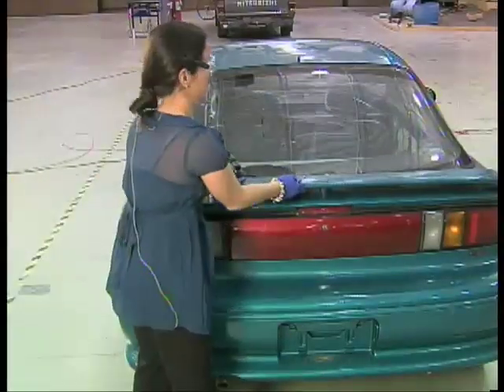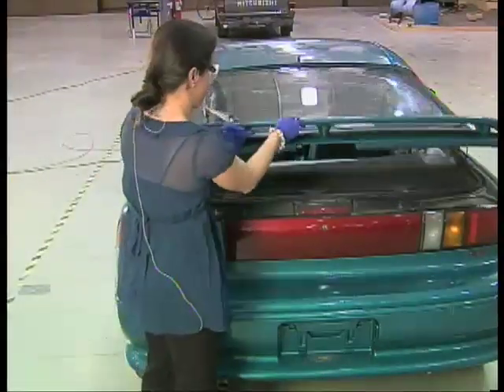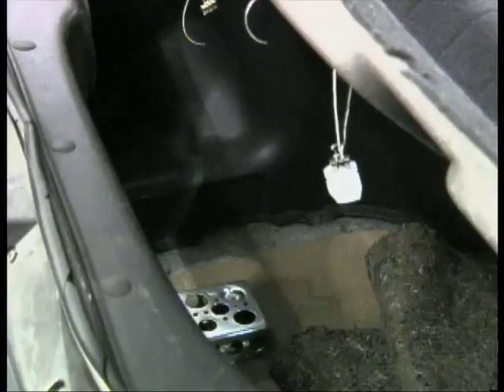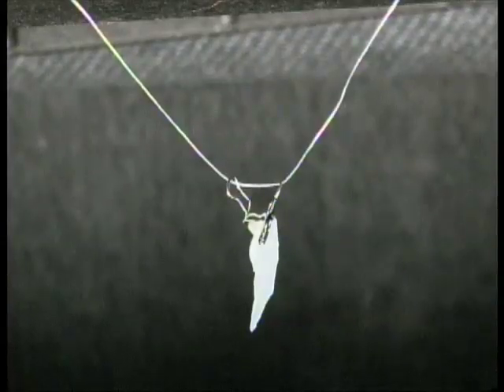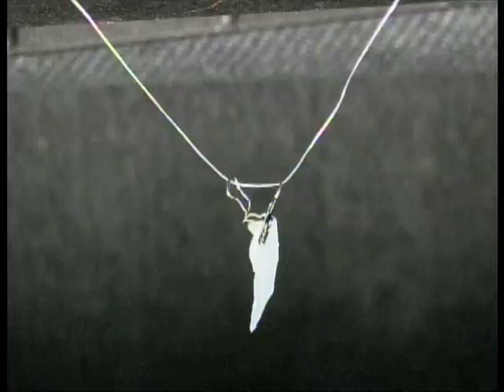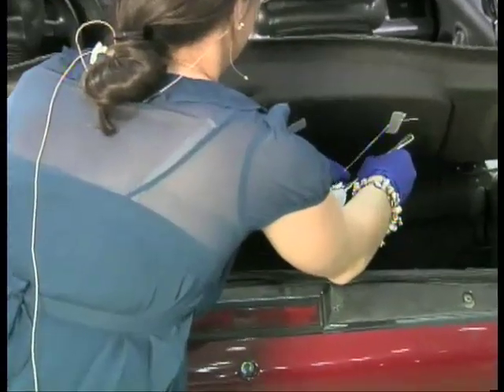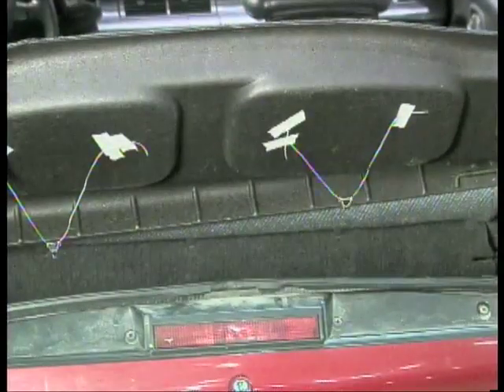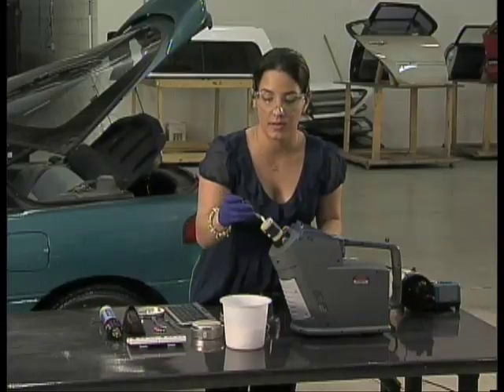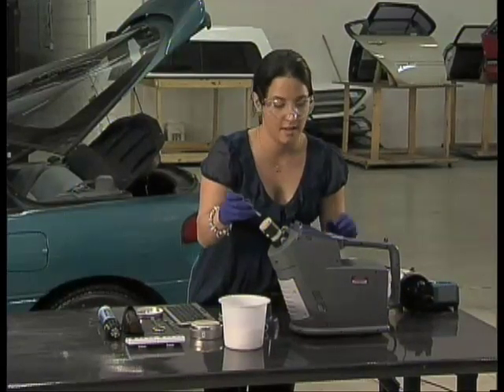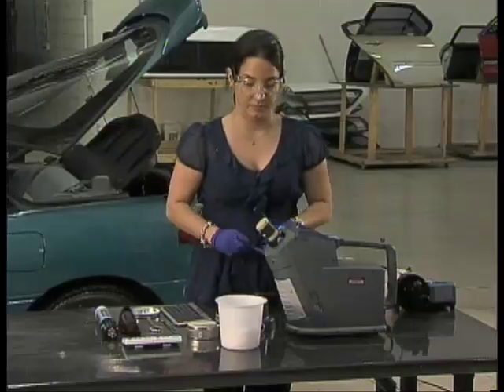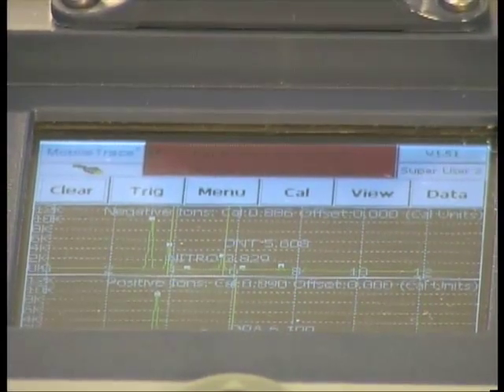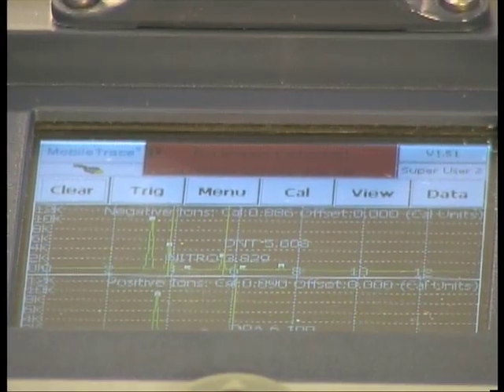We are opening the trunk and you can see the PSPME device that has been suspended in the head space. Taking it to the instrument, inserting it into the desorber, and pressing trigger. Explosives have been detected, with three peaks detected in the IMS.